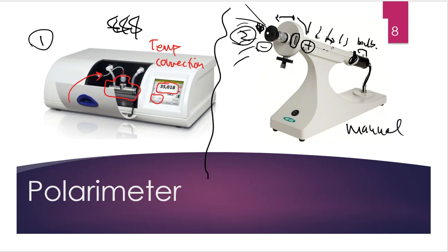All right, so that's where I'm going to stop this video. In the next one, we're going to talk a little bit more about a polarimeter. We're going to talk more about chirality and stereochemistry and why it's so important. And then maybe we'll hit a few calculations as well. So once I get raw data from these instruments, what should I be doing with that raw data? That requires an equation with a little bit of math and a little bit of calculator work. So here we go. We're still talking about optical rotation, and we're not finished yet.